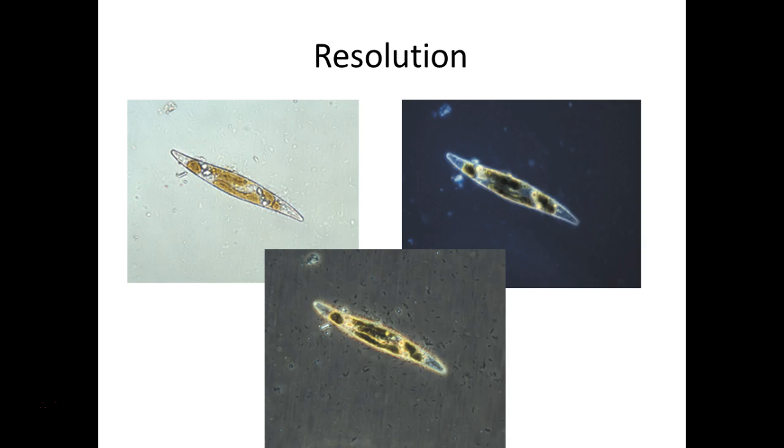Did you see those videos on YouTube of the protists moving around? Most of the really good ones are phase contrast. Yeah, or the organism has enough contrast that you can see it under light microscopy, but a lot of times it'll decrease the light, too, to create more contrast in order to have a better image. But the really good ones are usually dark field or phase contrast. I've seen some really amazing ones, too, with the detail. You could see the cilia moving, and they're really pretty ones. So much cool stuff out there. But those are expensive microscopes, and very good microscopists, very good scientists utilizing that microscope.